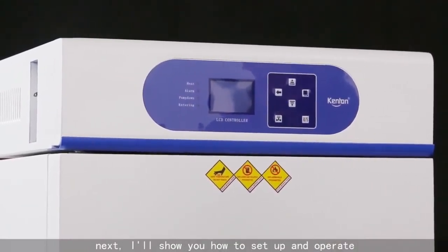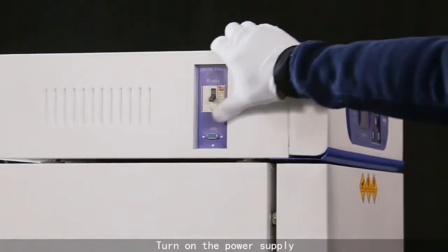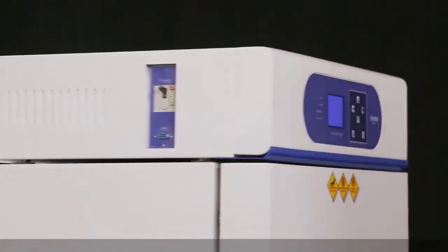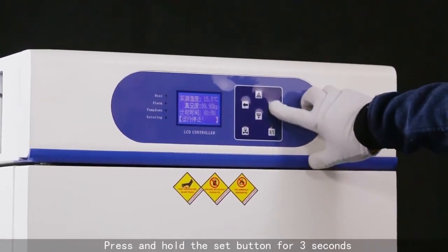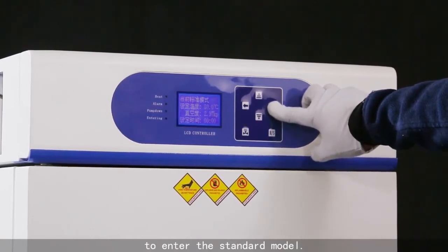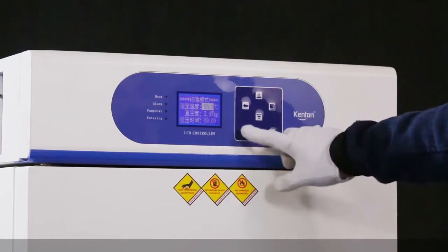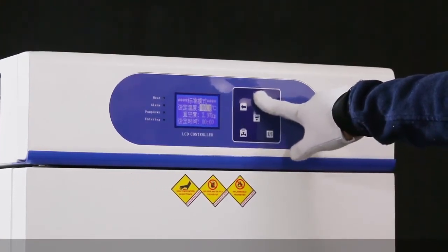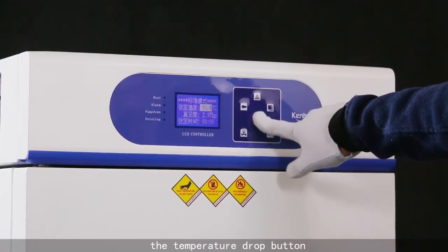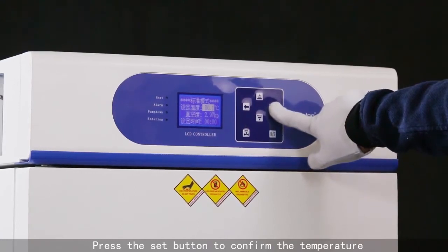I will show you how to set up and operate. Turn on the power supply. Set the temperature: press and hold the set button for 3 seconds to enter the standard model. Use the temperature rise button or the temperature drop button, then press the set button to confirm the temperature.